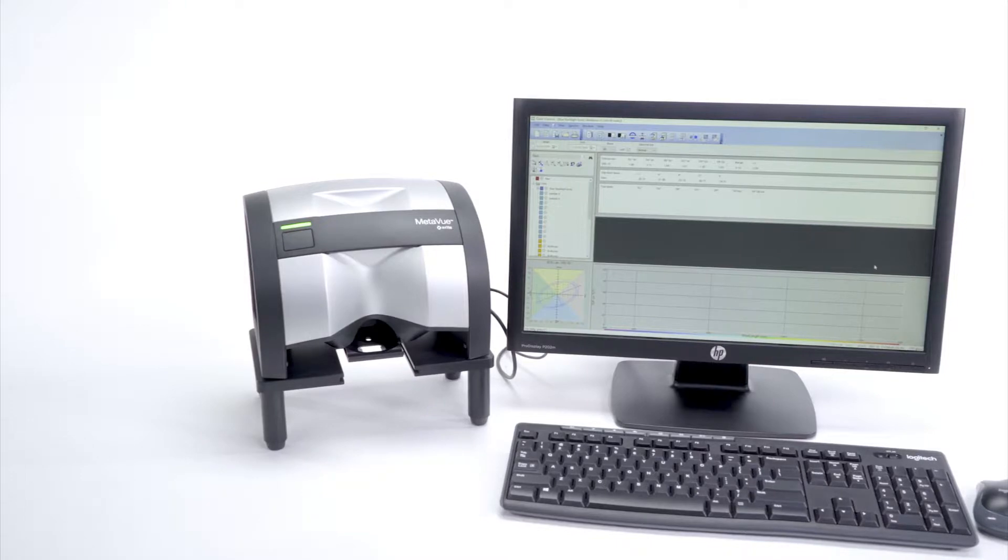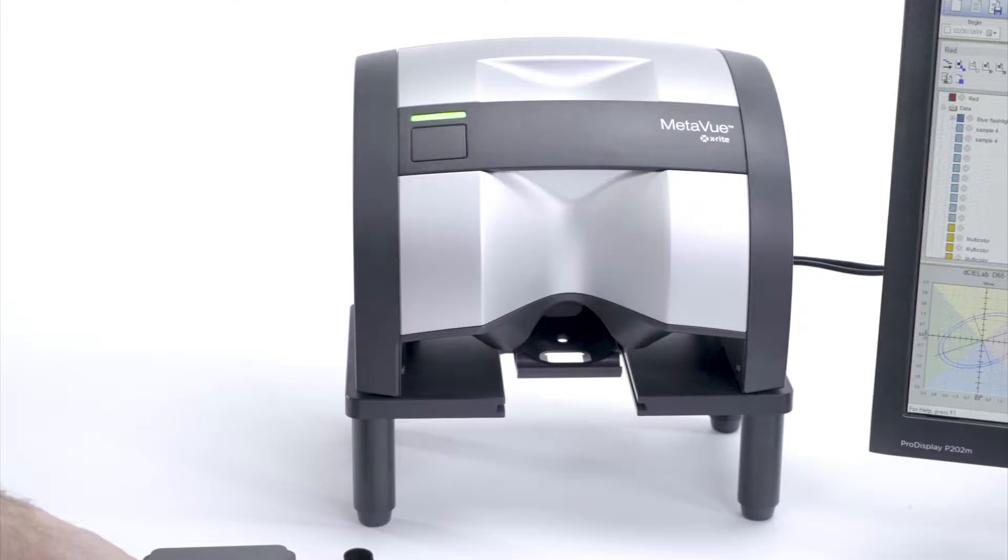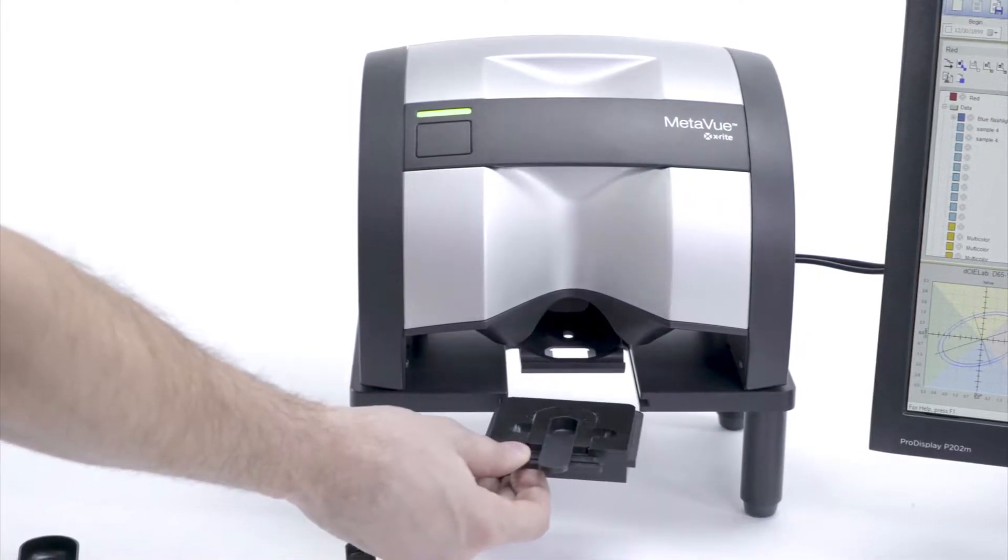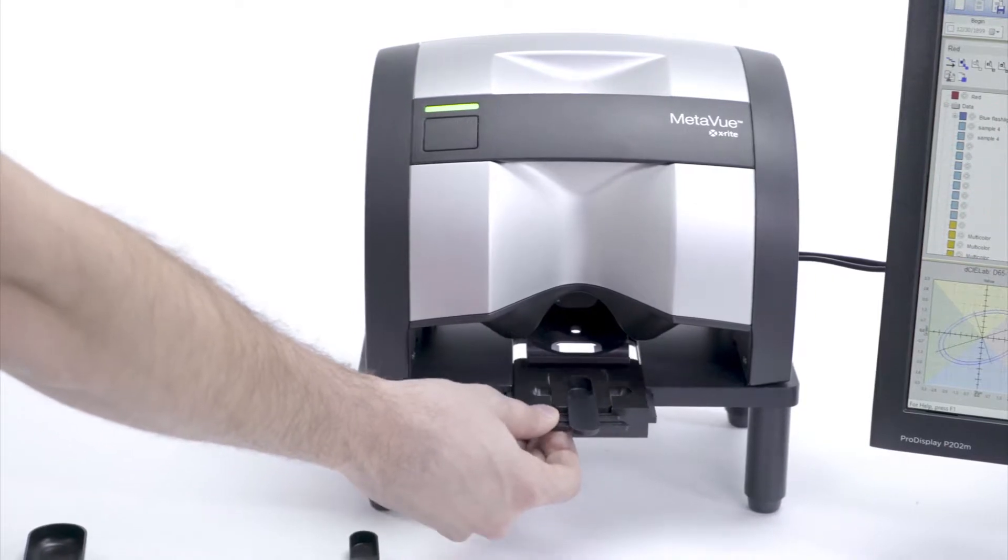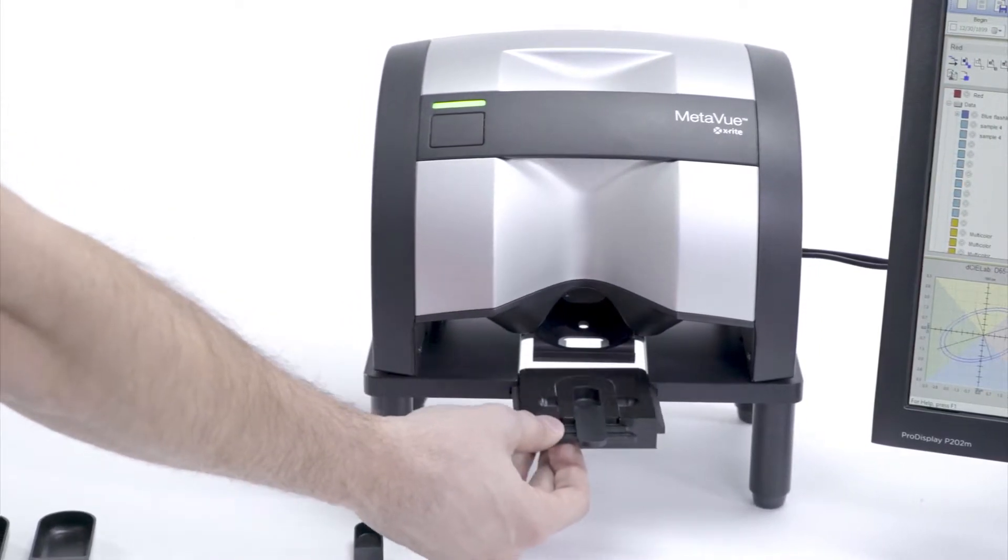The instrument stand places the instrument three inches above the countertop, with replaceable sample holders that slide in and out, allowing for easy measurement of pastes, powders, gels, and liquids.